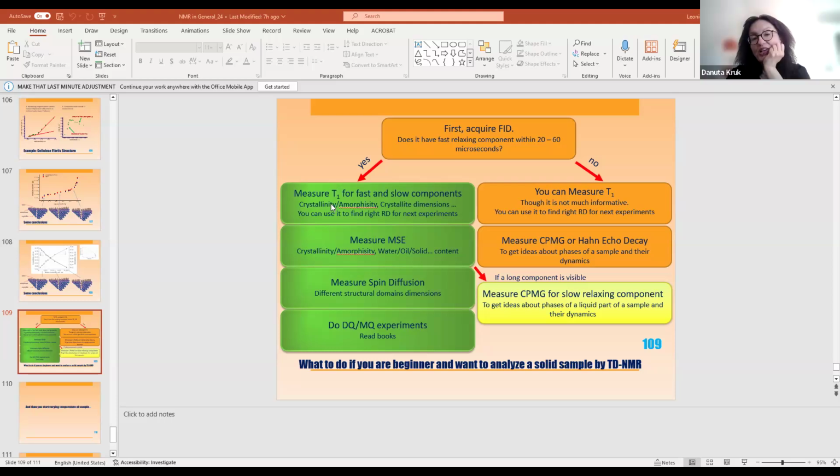T2 in 19F is difficult to measure, exactly because you cannot set up the right pulses, and the way you get sufficient magnetization to get the signal. The pulses are not correct. Pulses must be really long to have 90 and 180 degrees. So just to observe the signal, it's possible, but to measure precise T1, T2, it will be influenced by lots of factors.